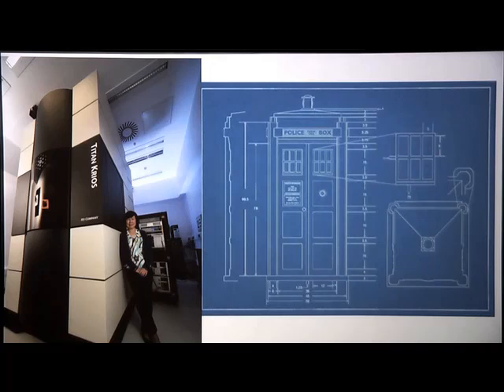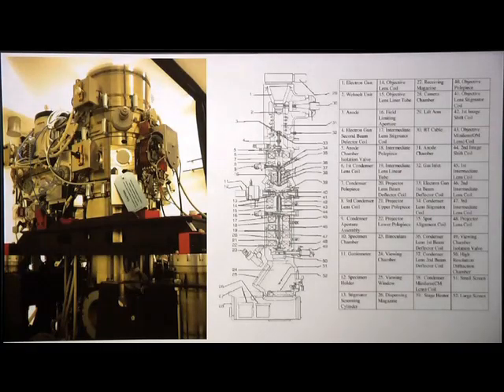So I'm hoping we can actually go into this box a little bit more, and I can convince you that you can understand how it works, and the deeper you go into it, the more interesting it gets, at least for me. But not only that, even if you don't understand all the details, you can know enough that you will be a much better microscopist and do a much better job of getting to your goal, which is a new structure. So if you take the box off, this is what it looks like.